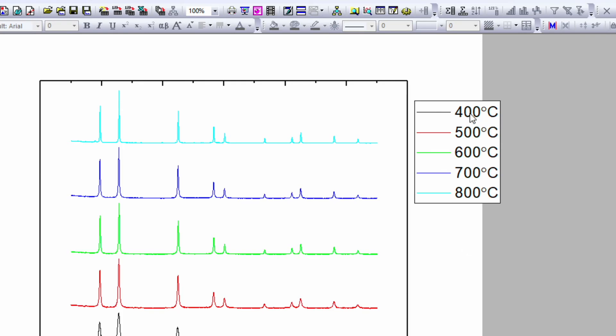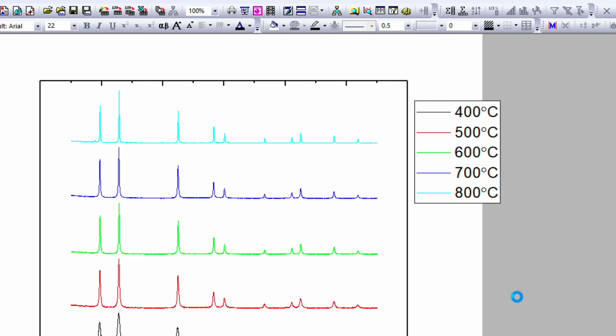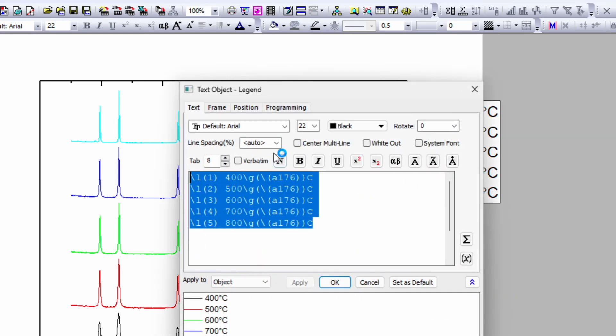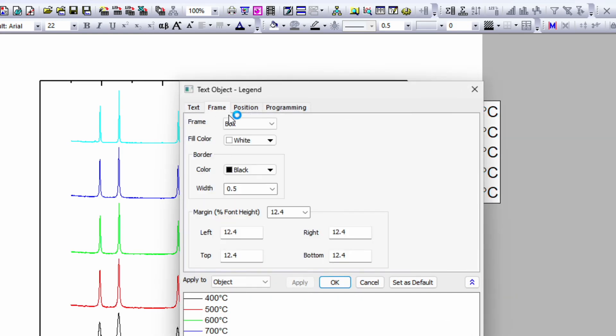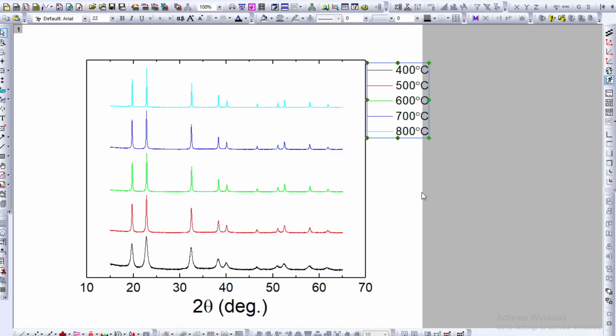I don't want to see this box. To remove it, right-click and go to properties. In properties, you'll see an option for frame. Select none, and when you apply, the box will disappear.